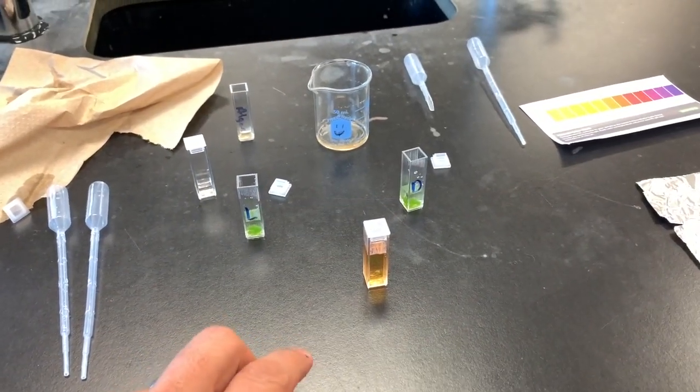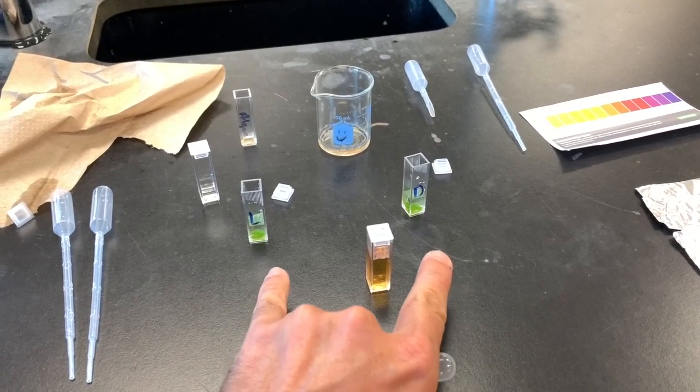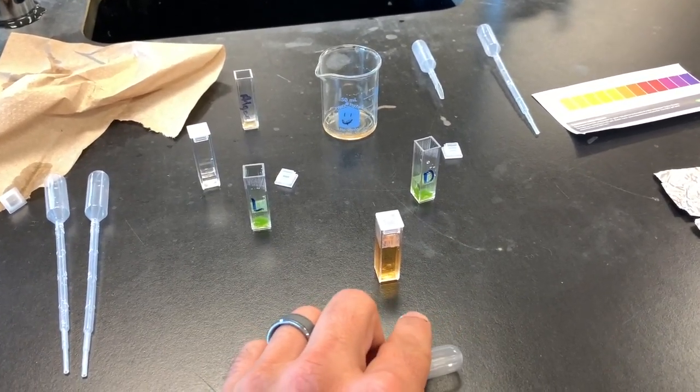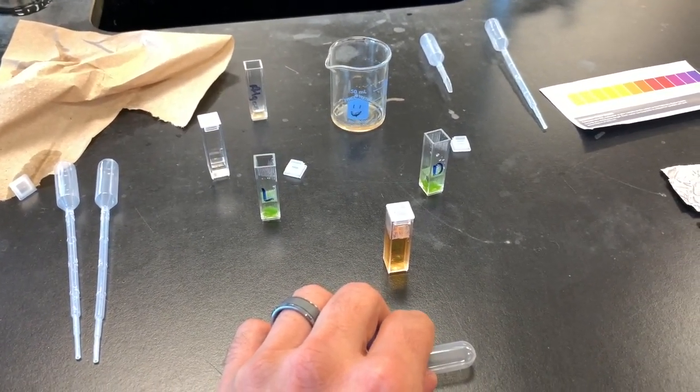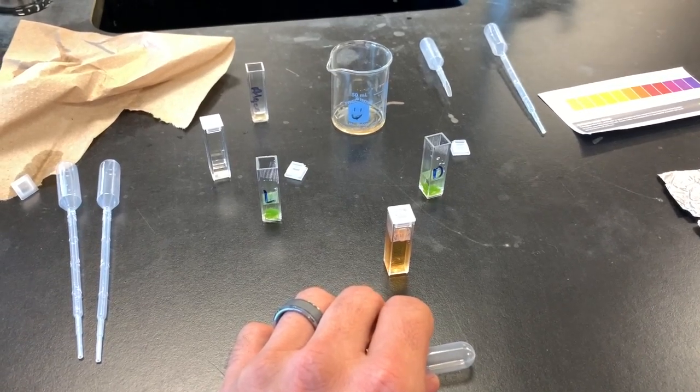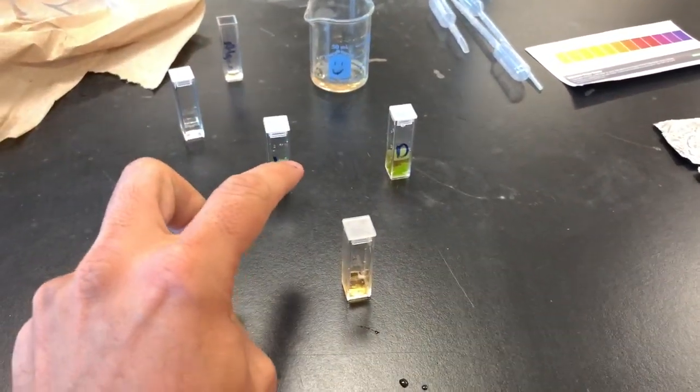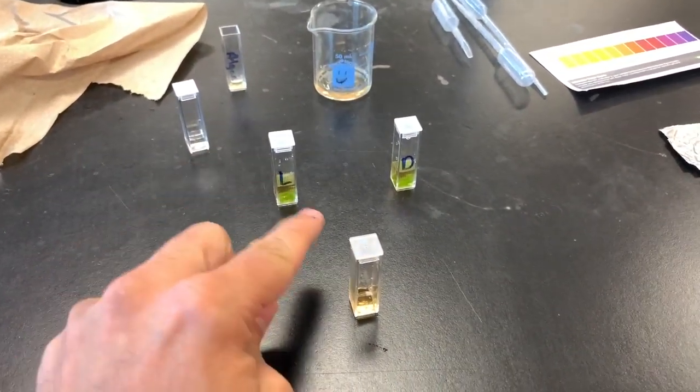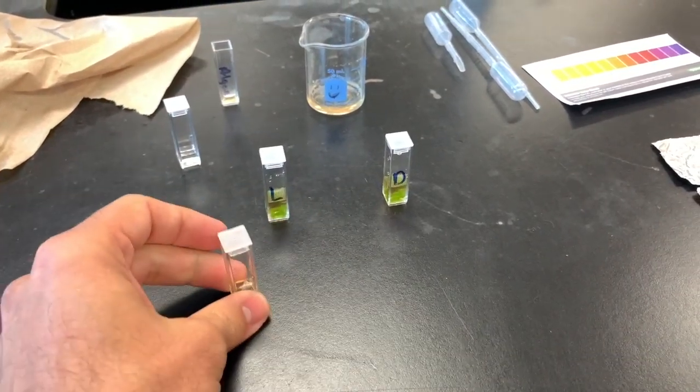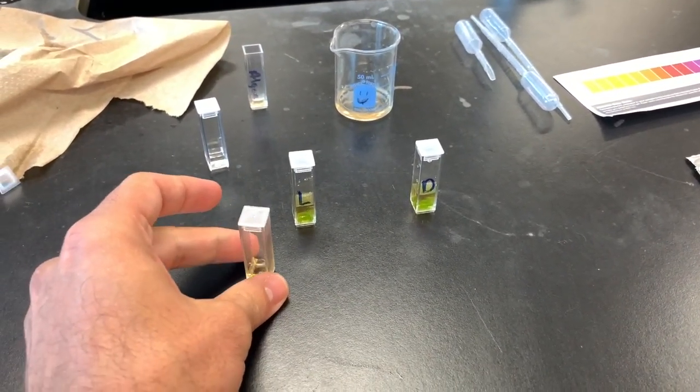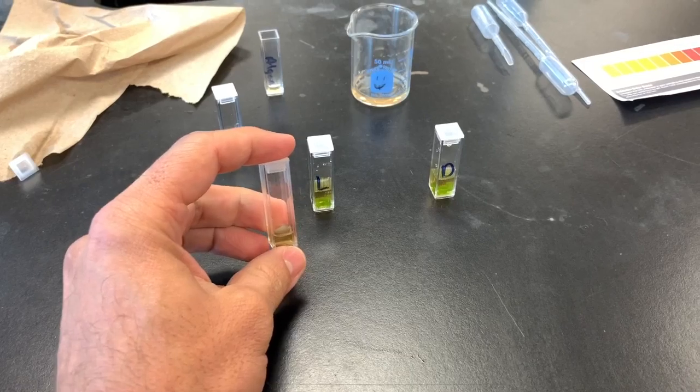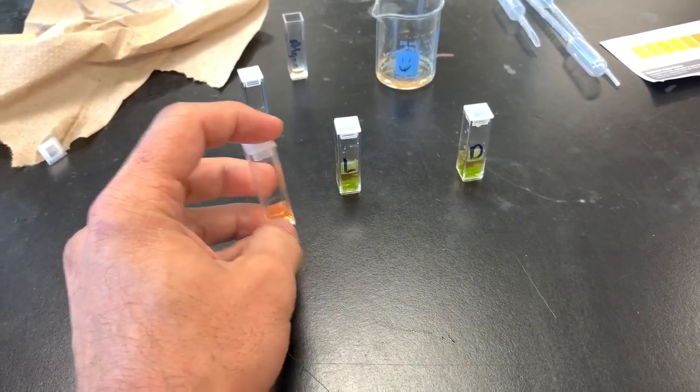So once you have the indicator solution in each one of those, you're going to take an initial pH reading. And I'll show you what that looks like. Okay, so here you can see I removed the water, the distilled water that was in there, allowing the algae beads to wash out. And I have replaced the water in there with one milliliter of the indicator solution.